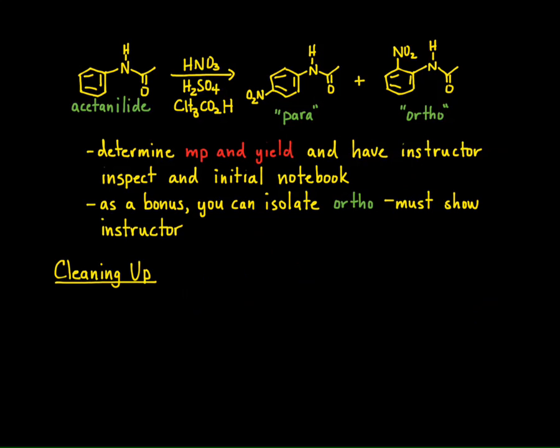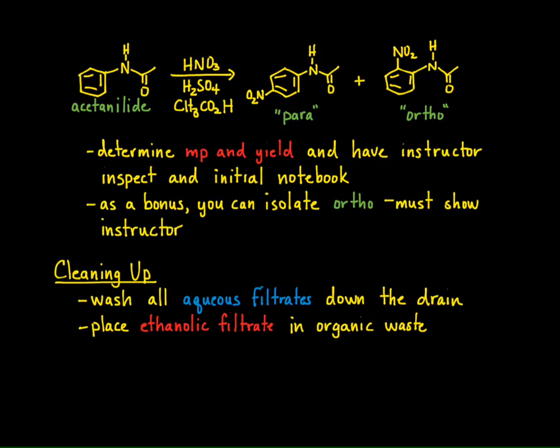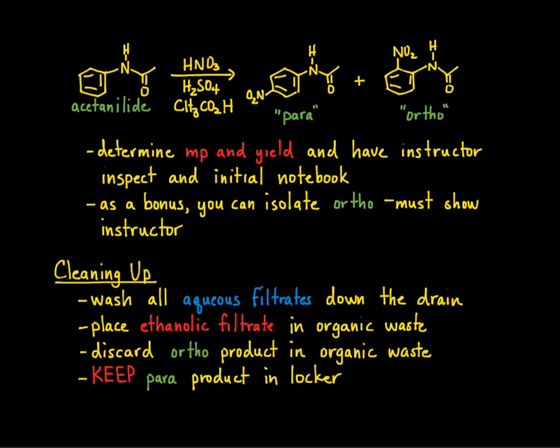To clean up, you need to wash all aqueous filtrates from the reaction mixture down the drain and place the ethanolic filtrates from the recrystallization process in the organic waste container. If you isolated the ortho product, after showing it to your instructor, you can simply discard the solid in the organic waste container. Please make sure you keep the para product and place it in your locker.